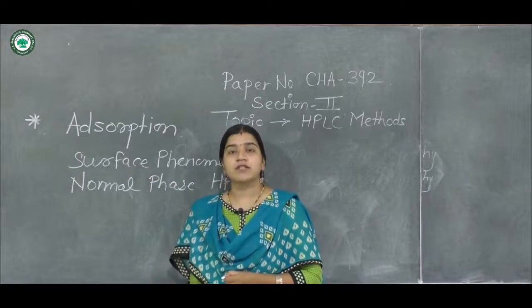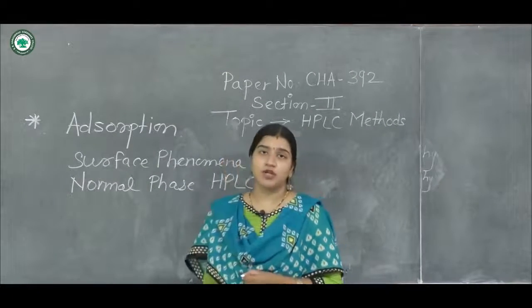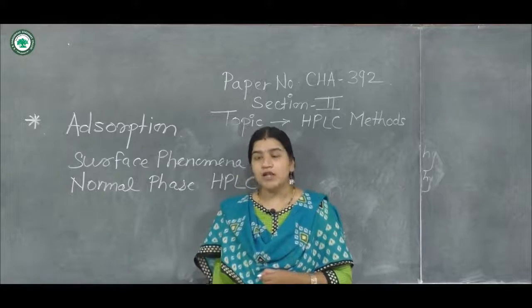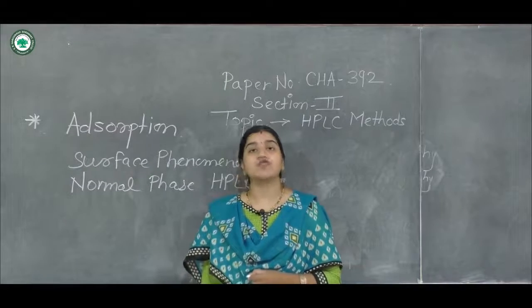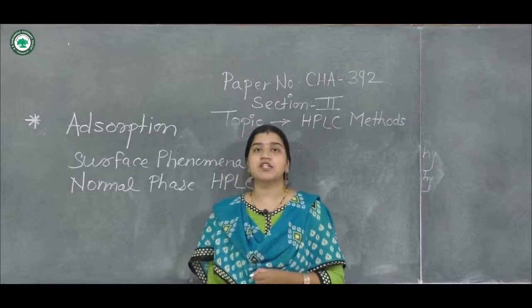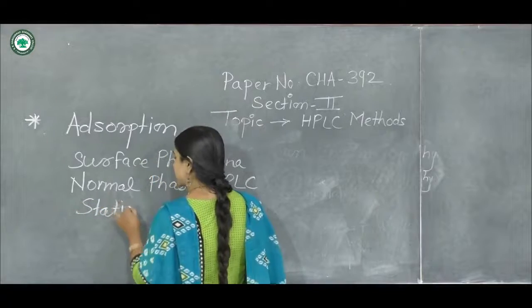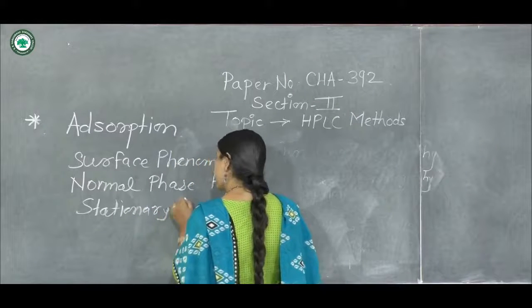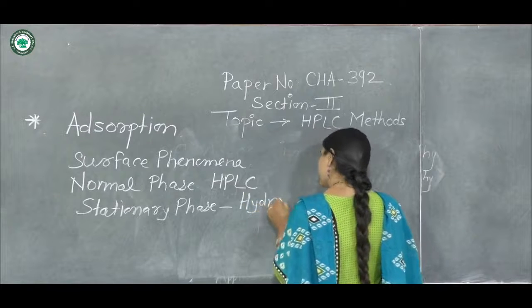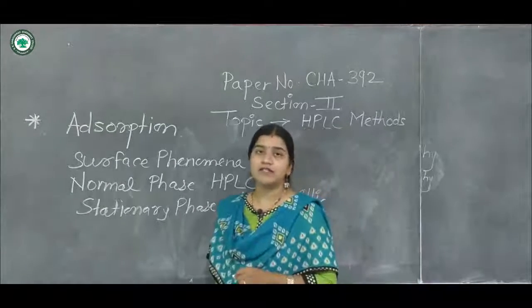Now, what is the main difference between normal phase and reverse phase HPLC? In case of normal phase HPLC, the stationary phase is hydrophilic while the mobile phase is hydrophobic, and in case of reverse phase HPLC, vice versa is the case. So, as far as normal phase HPLC is concerned, the stationary phase is hydrophilic while the mobile phase is hydrophobic.